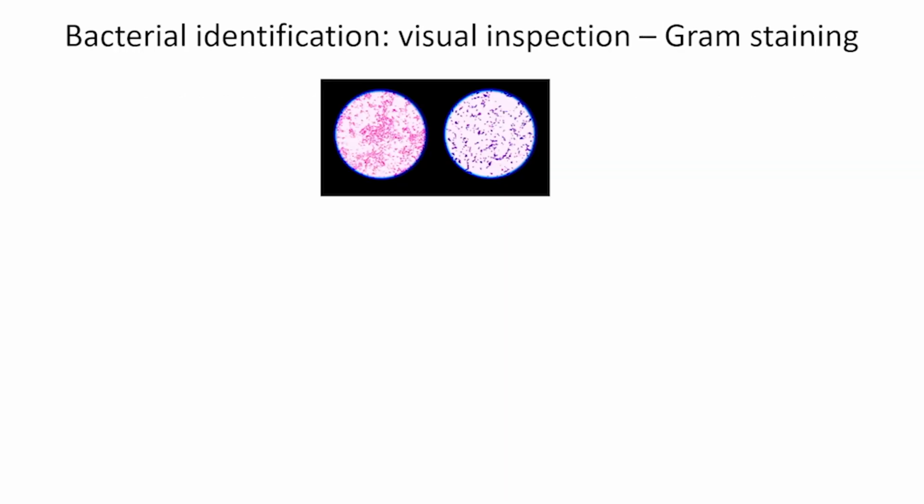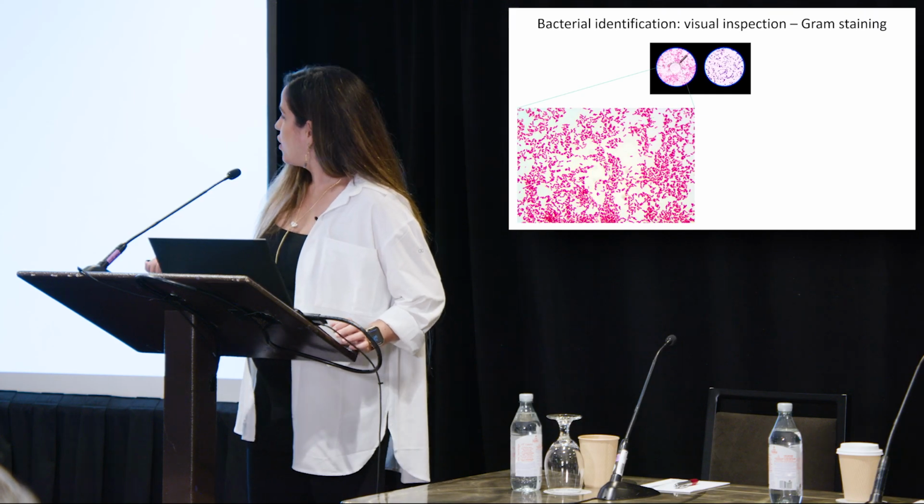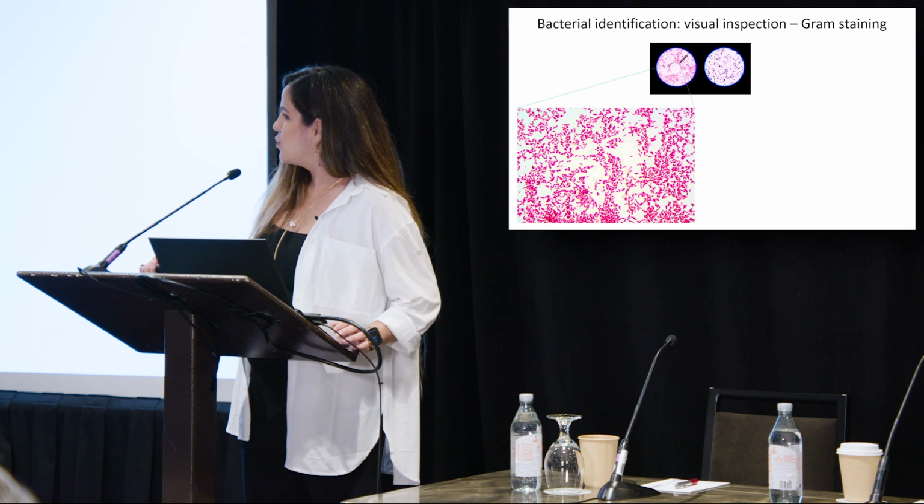Right, so during these staining techniques, usually we see two types of colors on the microscope. We see what we call gram-negative microbes, and these are very important. I bet you heard a lot about them before. These gram-negative bacteria are usually involved with infectious disease. They're usually involved with conditions such as small intestinal bacterial overgrowth, and we can actually see them on the microscope. You can observe that they have red colors and a specific shape. In this case, it's a bacilli shape, right?